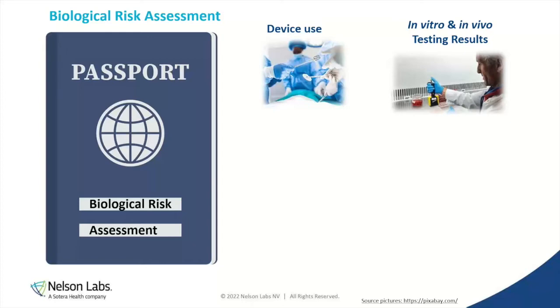And not from the perspective of how the device functions as far as what it does for the patient, which is important, but in this case, that's a side note to how it contacts the patient. So that detail is really critical. And then, of course, we're going to talk about any testing results, all the failures too, because those are teaching us, plus what we've discovered through additional testing.